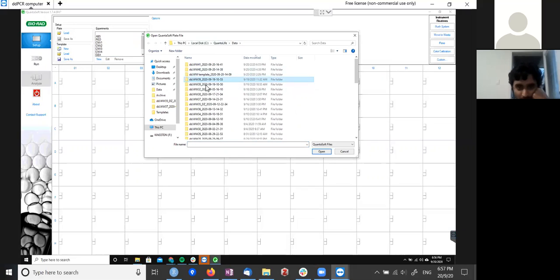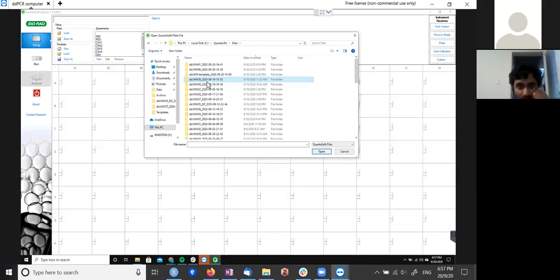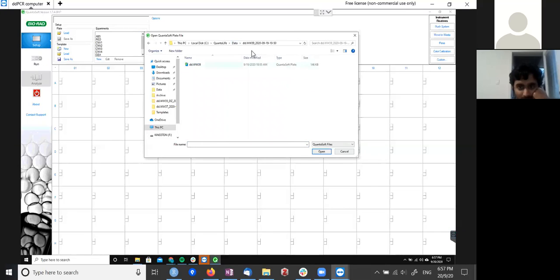You notice how there are 2 things of the same name for the 39. One of them is an empty file and the other one has a lot of things in it. You can see the size here, it's 13,000 kb. The other one is 146 kb.